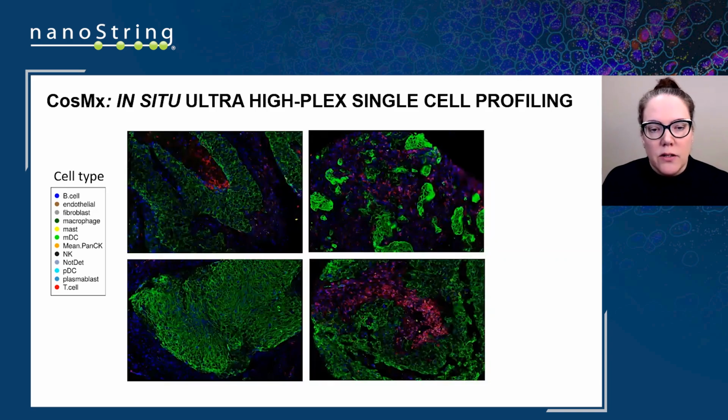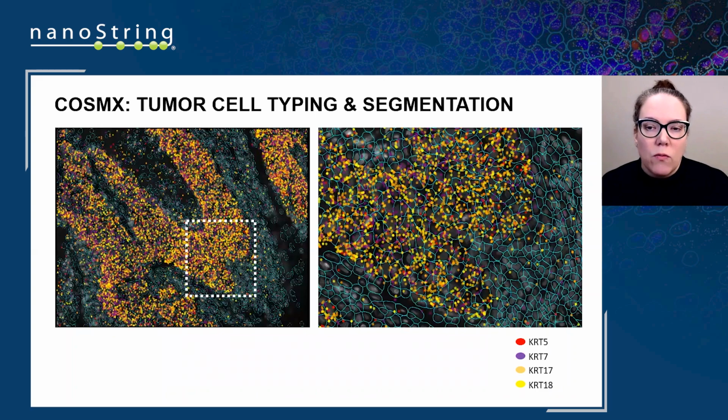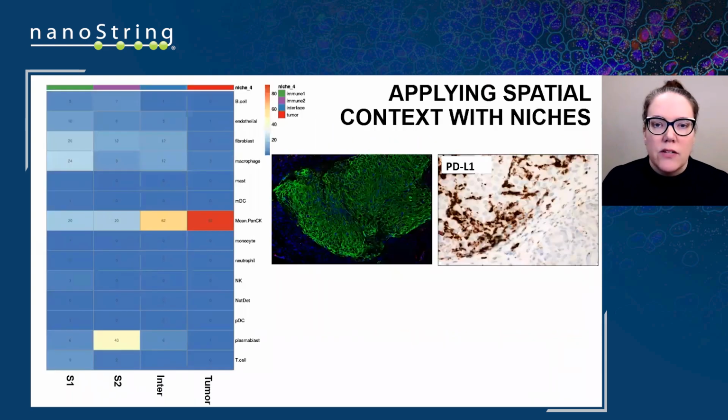So once again, as a reminder, what the actual immunofluorescence cores look like. So that's the first level of demonstrating fidelity in terms of whether those cell typing approaches actually work. And then to be thoroughly satisfied, not only typing, but with the segmentation approach, what we elected to do was superimpose the transcripts from a variety of cytokeratins, which are variably expressed in triple negative breast cancer, and illustrate this sharp delineation even further. And then you can see here on the right at a higher magnification, really nice high fidelity segmentation. So it looks really good. We're really getting the targeted population that we want, which was an important quality check for the instrument.